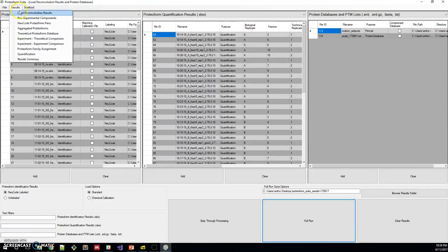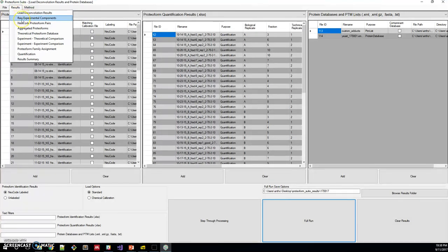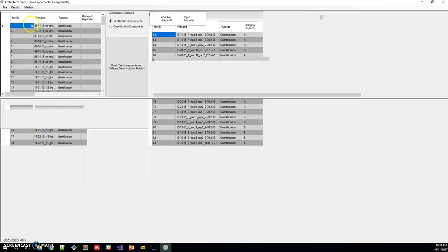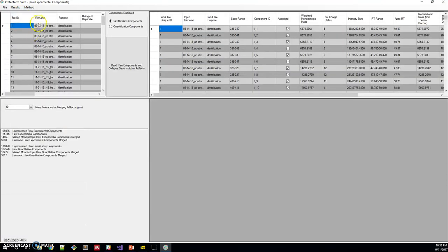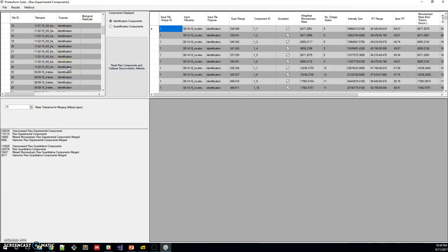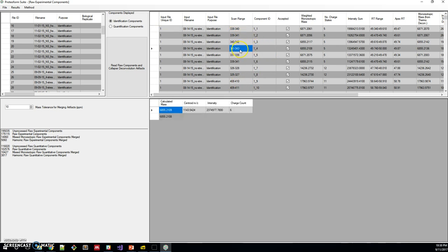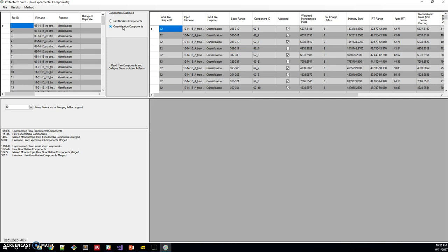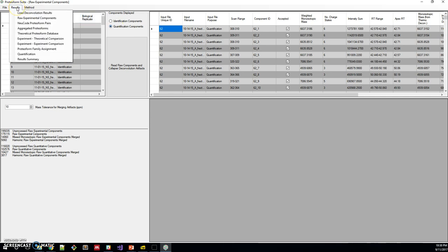Right now we're in the load deconvolution results frame, or page. Next we'll step into raw experimental components. On this page, on the left we have the list of files that went into this. On the right we have all of the masses measured and intensities for those masses. When we click on one of these, you can see the different charge states for that mass measurement with the intensity of that charge state. You can also click here to find the mass and intensity measurements for quantification.